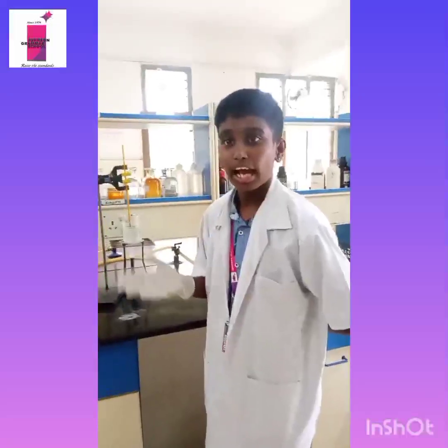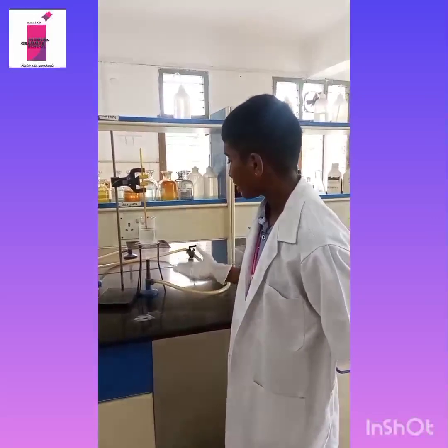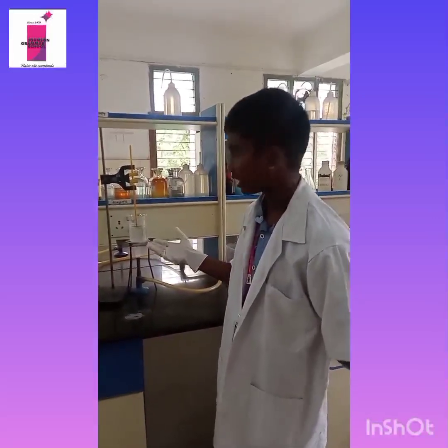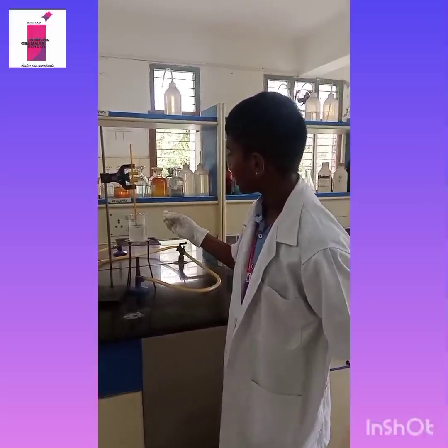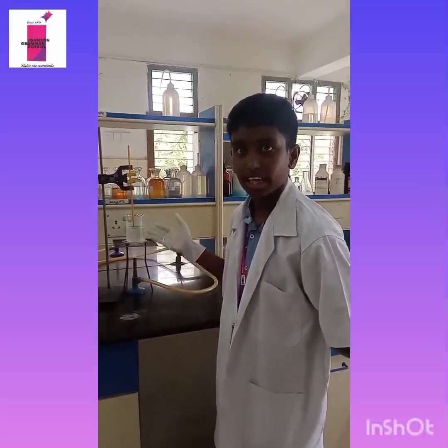of water and how temperature affects the change in the state of matter. Now here we have taken a Bunsen burner with a mesh and a beaker with 150 ml of water and an alcoholic thermometer where the temperature is measured in Celsius scale. Here we can see that the temperature is increasing because the water is not changing to the gaseous state.